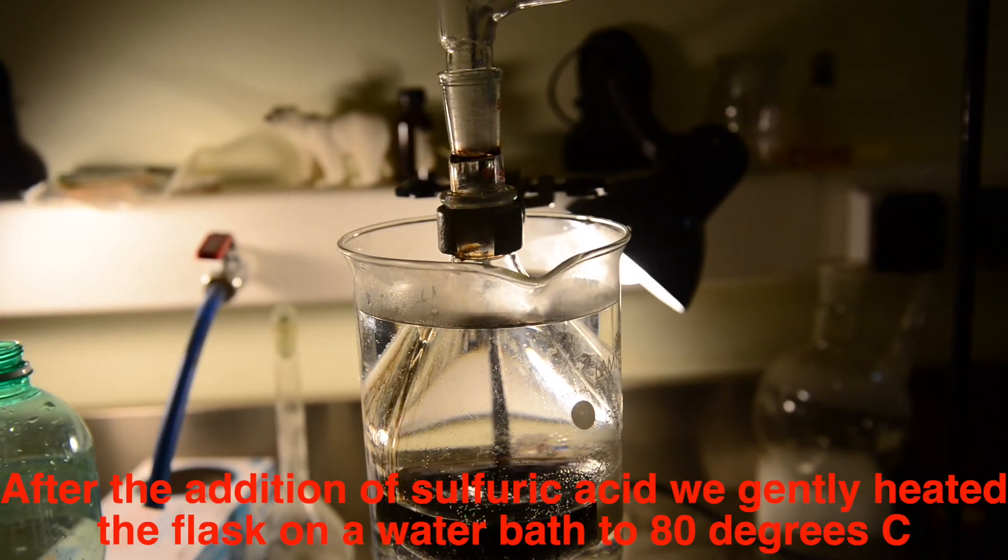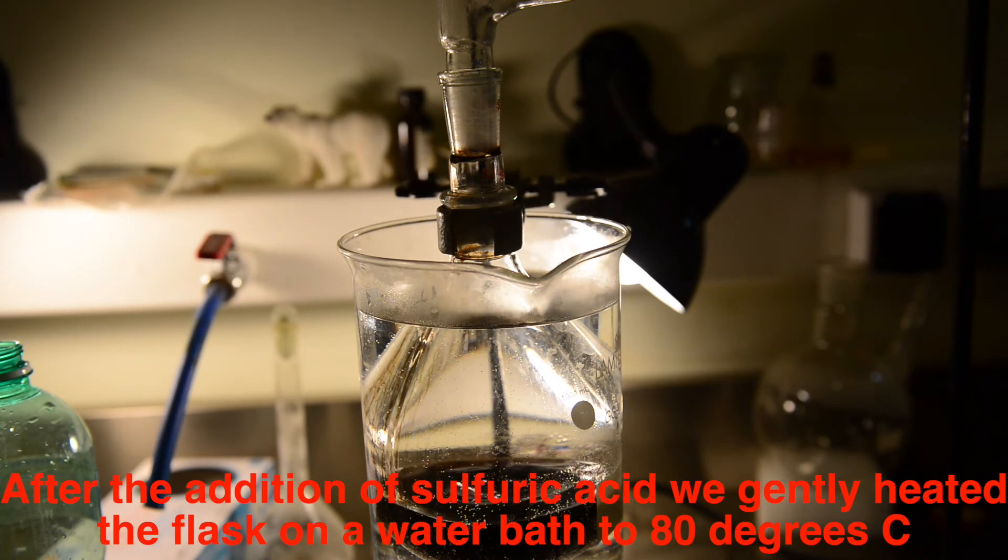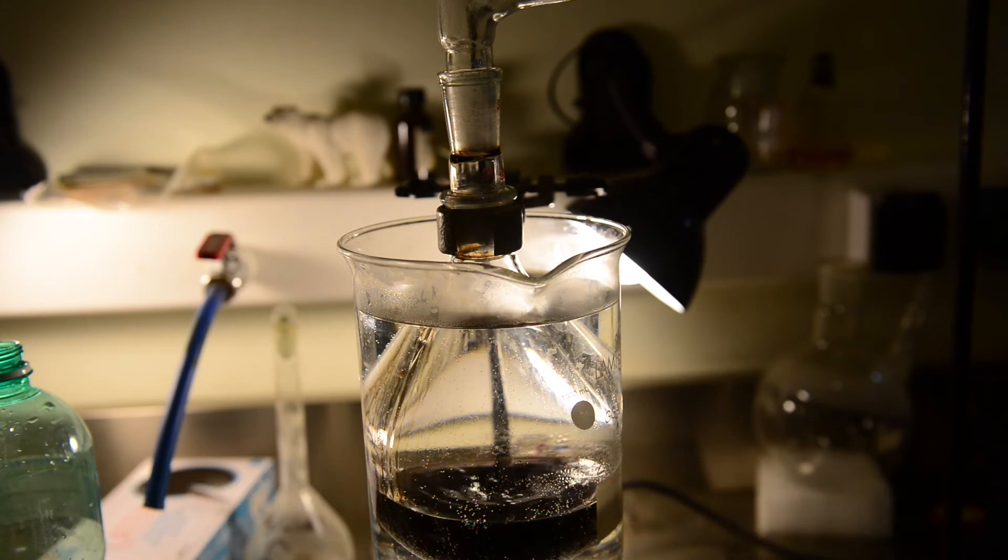That time, we were patient and had not had the flask heated until we added all the sulfuric acid. 70-80 degrees was enough for the reflux to start in the flask and the distillate began to come over.